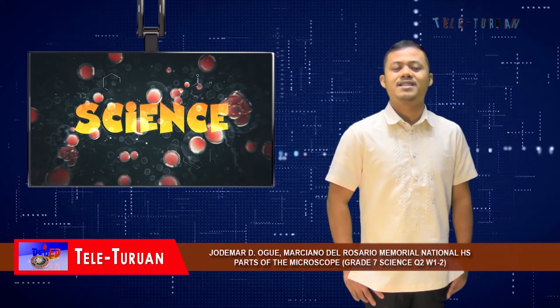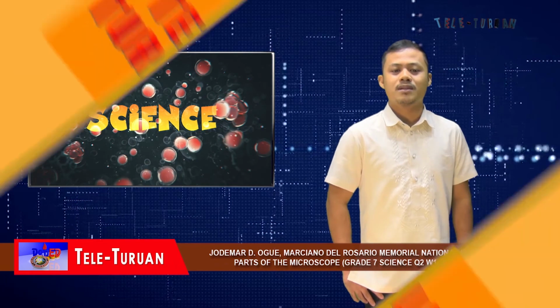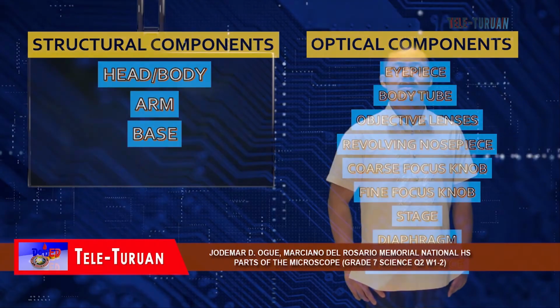Now, let's summarize it. Parts of the microscope can be divided into two groups: structural components and optical components. Under structural components are head or body, arm, and base, while the optical components are eyepiece, body tube, objective lenses, revolving nosepiece, coarse focus knob, fine focus knob, stage, diaphragm, and light source.